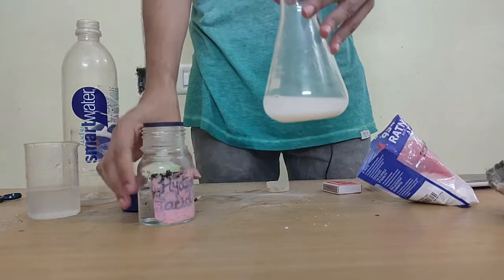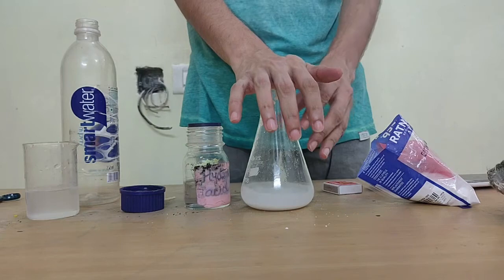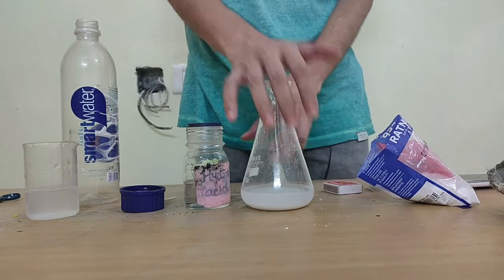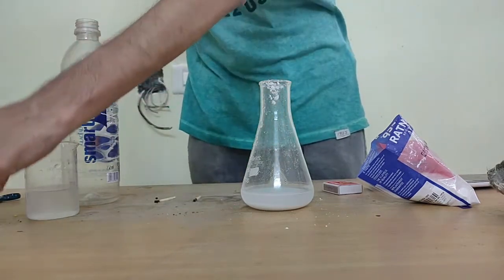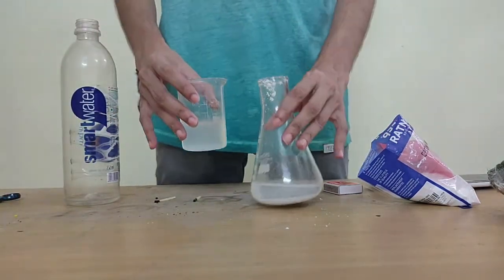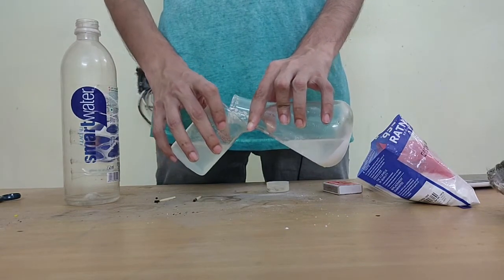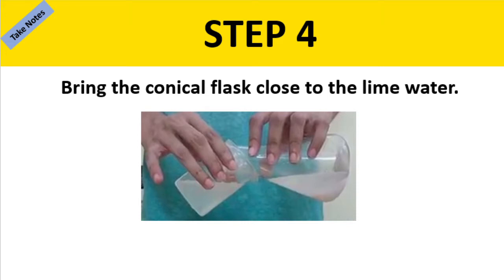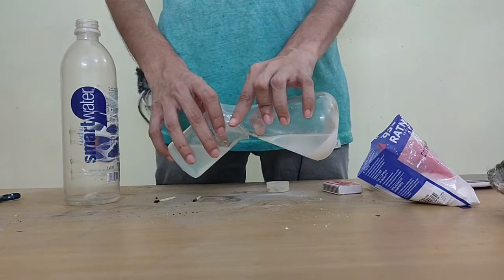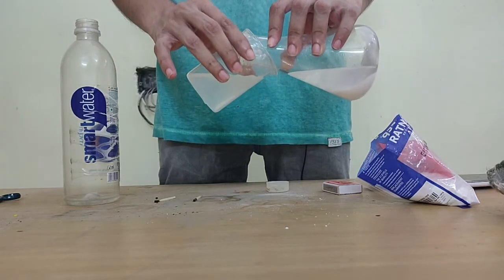All of that bubbling is nothing but the reaction for carbon dioxide gas being produced, right? Now I will try to do this test again. This is not the right equipment for it, but we will try nonetheless, to see if there is even a slight chance of it happening. It tests two methods at once, right?